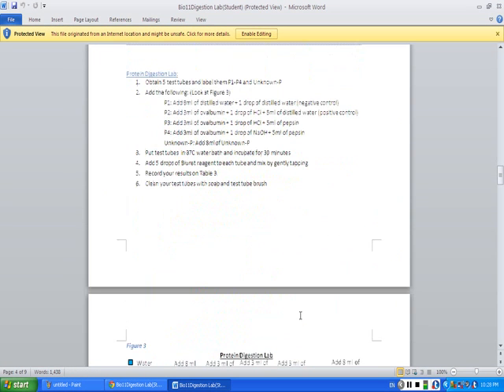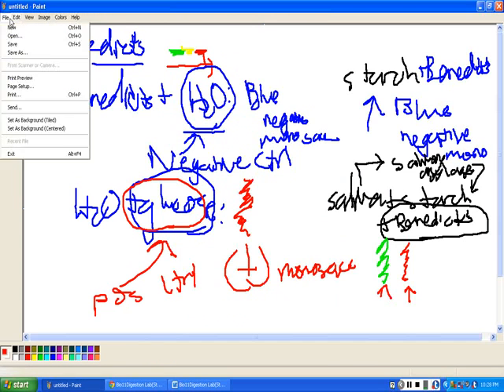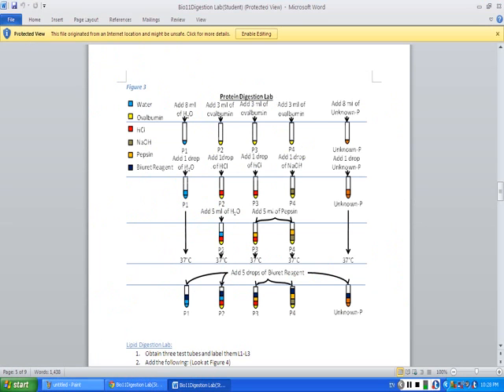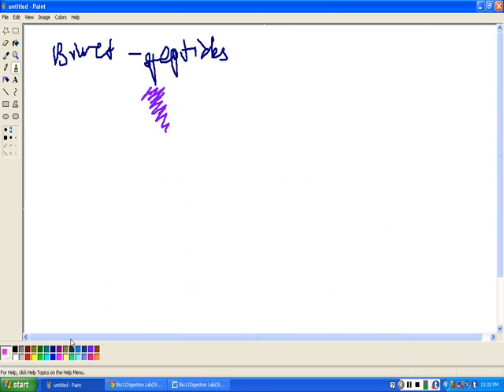Alright, so that's it for carbohydrates. Let's go on to proteins now. With proteins, I guess we'll talk about the indicator first. The indicator is biuret reagent, and remember, this detects peptide bonds, so it's an indicator for peptides, basically. The greater the amount of peptides, the more purplish the color it gets; the lesser the amount of peptides, the more pinkish in color it becomes.